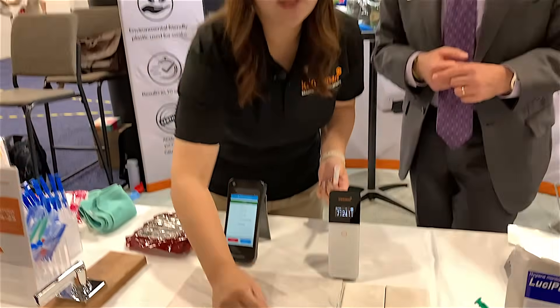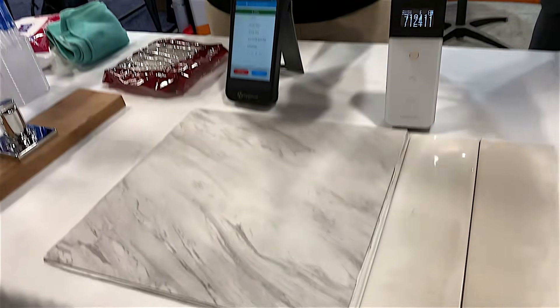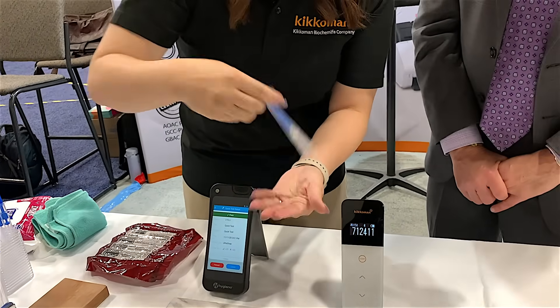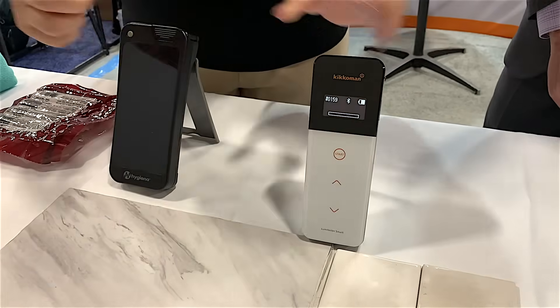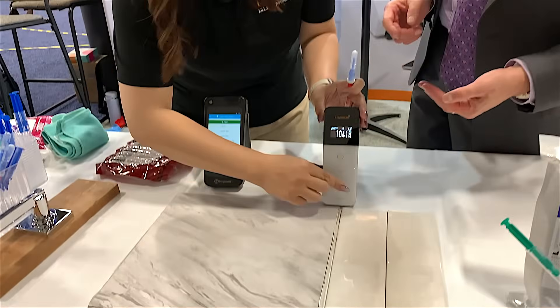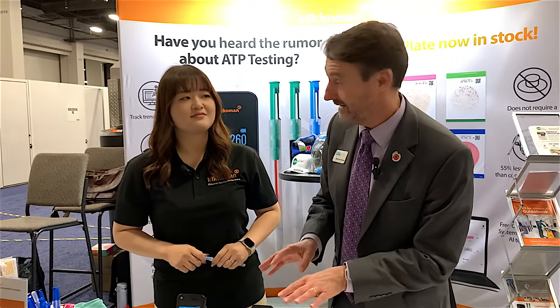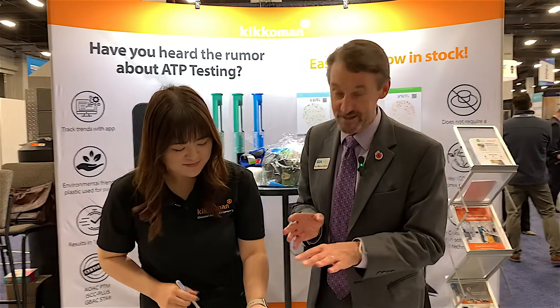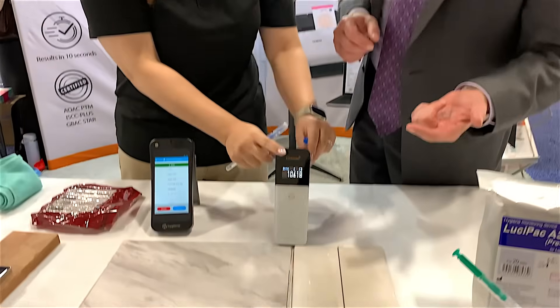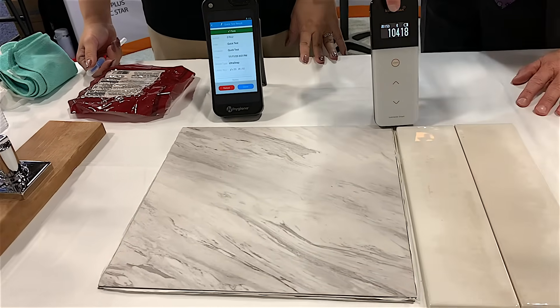Now we're going to test and compare it — before when it was dirty to what we've done with a very simple clean. I'll collect the sample the same way: rotate, put on good enough pressure, side by side, push it inside, mix it in together, put it inside. That's why we have to measure. So we started off with 712,000 — that's really dirty. I go into a lot of crime scenes and I don't get measurements like that at all. After that very simple clean — no chemicals — we got it right down to 10,000.